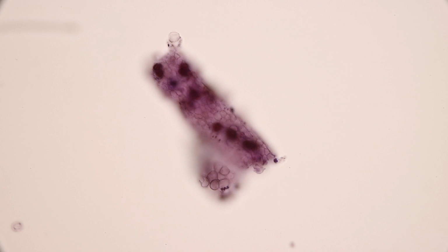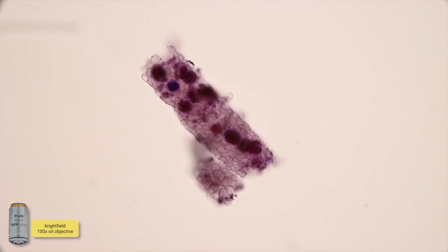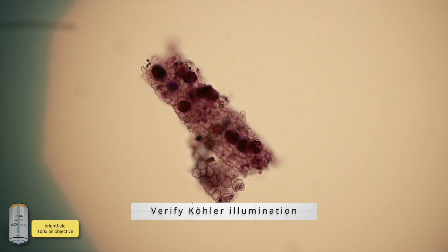We're now going to switch to a Sternheimer-Malbin stain slide. Here under the 100x oil objective, we see a mixed cellular cast. This looks like predominantly red blood cells, but there are other cells there.